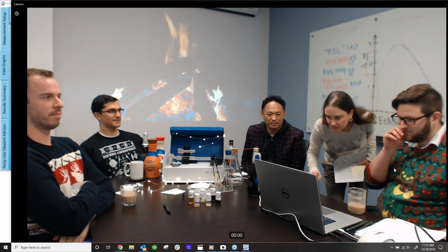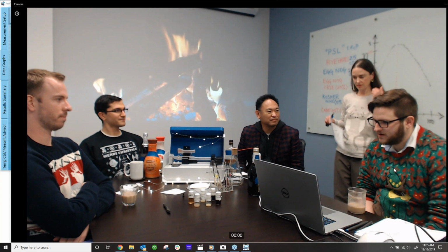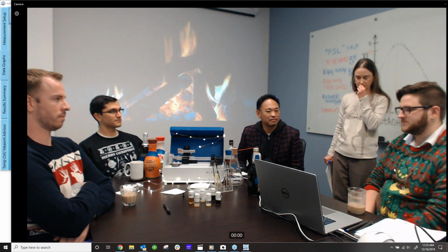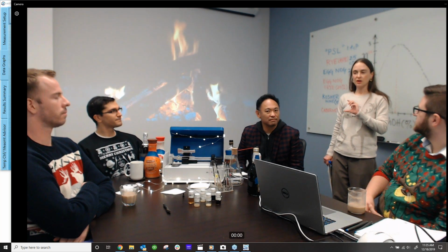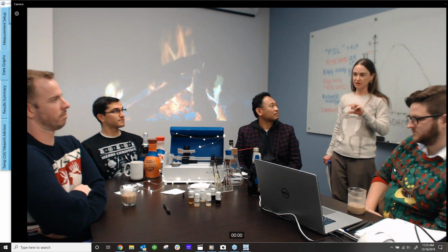So we have one question so far. What is the rule of thumb for the particles? I assume they're talking about particle size. So it's dependent upon the chip depth, correct? Yeah, you want to make sure that the particles in your samples are less than 10% of the channel depth.